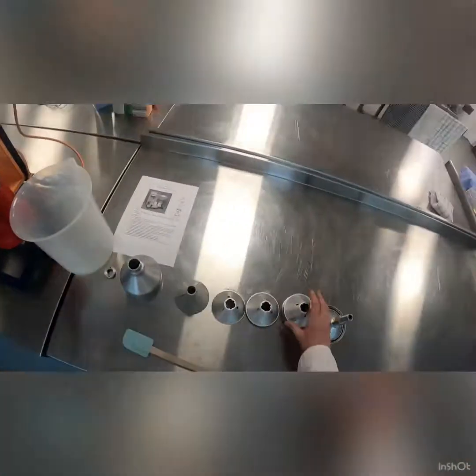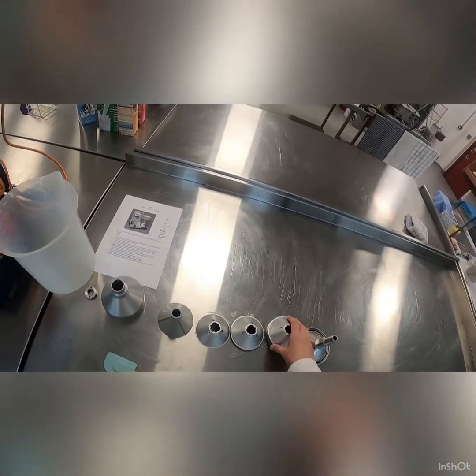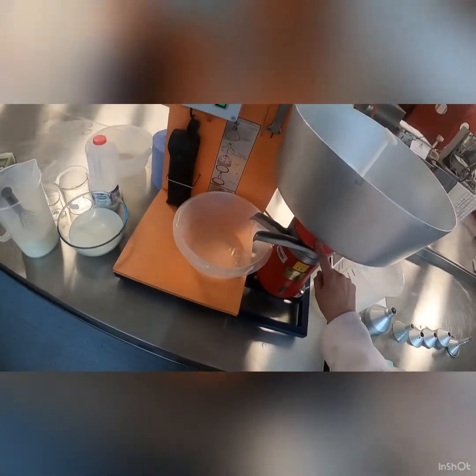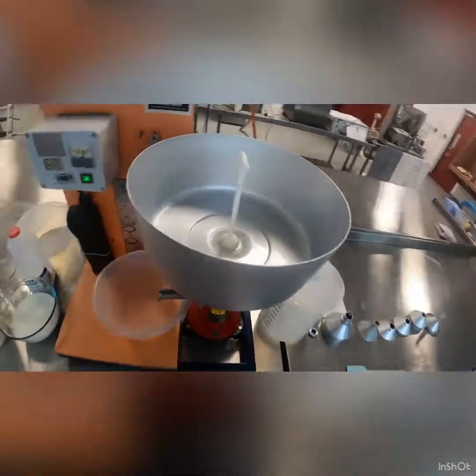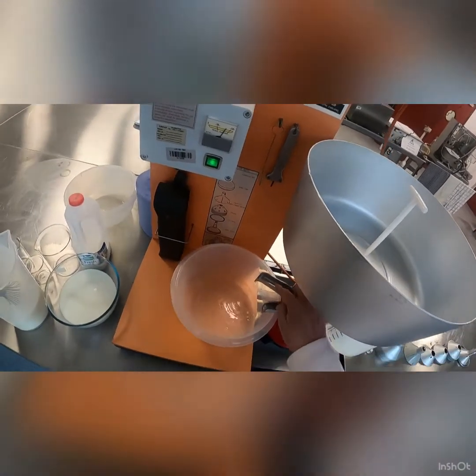Inside this part here there are loads of little plates, and you can see the holes in them where the milk comes into the middle of the machine. Then by centrifugal forces it pushes the samples out to the side, dividing it into a lighter portion and a heavier portion.